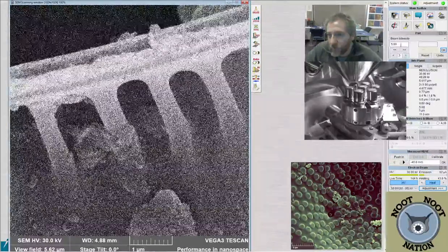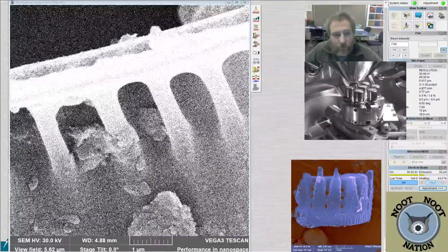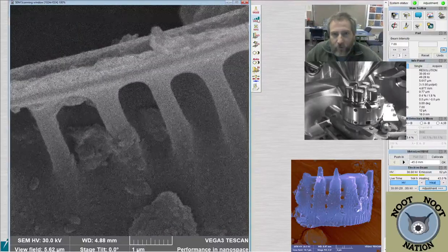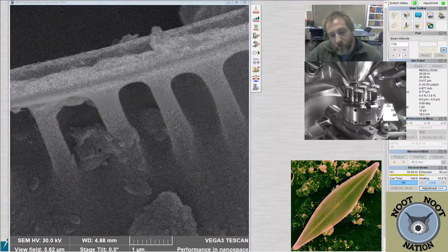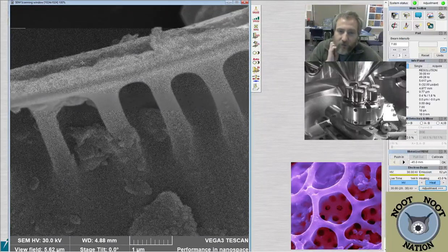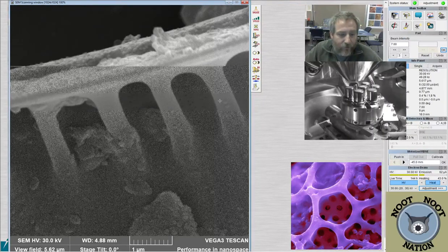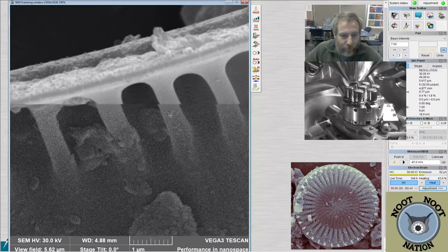In the fall of this past year, some students went out and did the coring. And then normally you can't core in a river, or you can, but it doesn't usually have very good results. But this site's sort of an exception, and it's a pretty interesting one. So in any case, I'm looking for diatoms from these samples to collect some images for the poster.